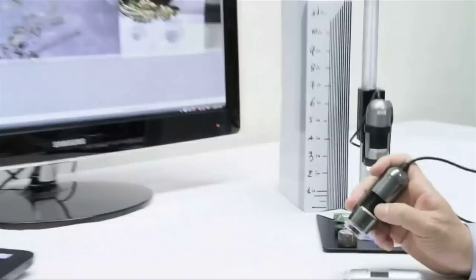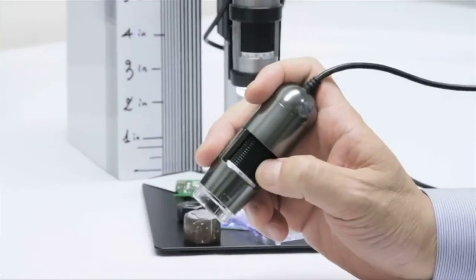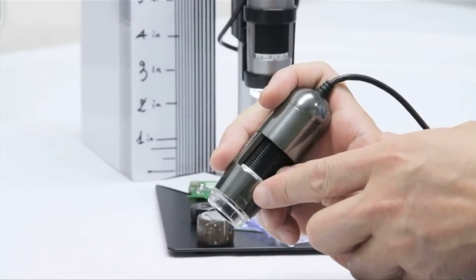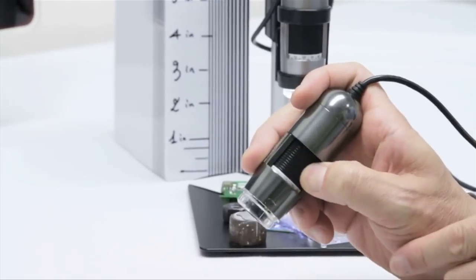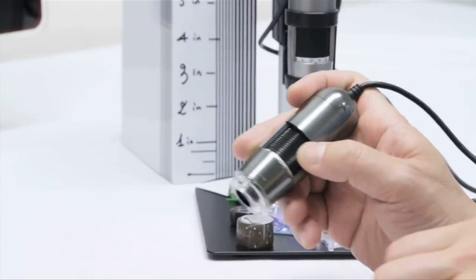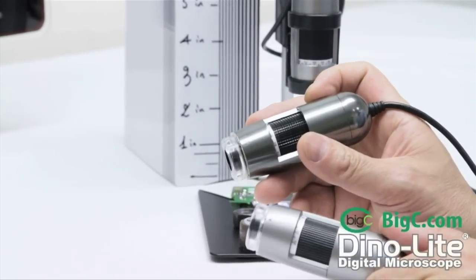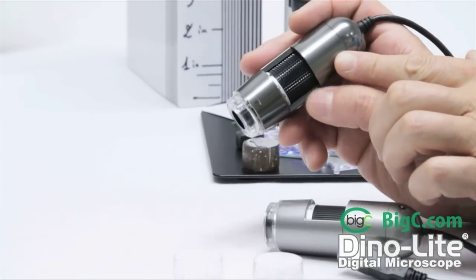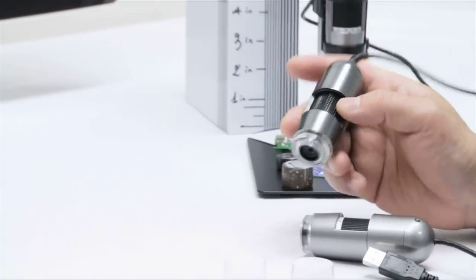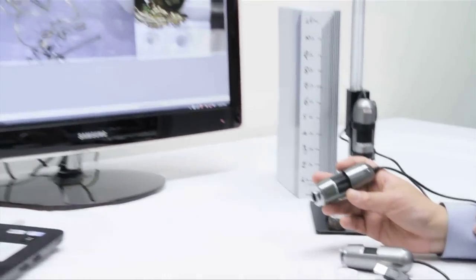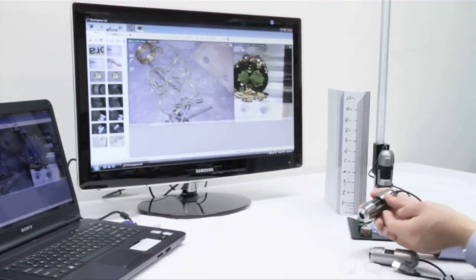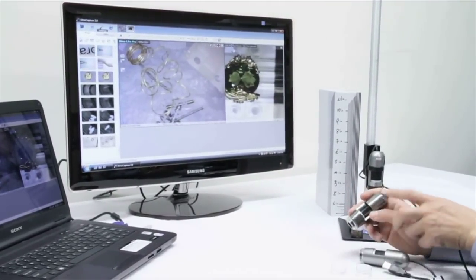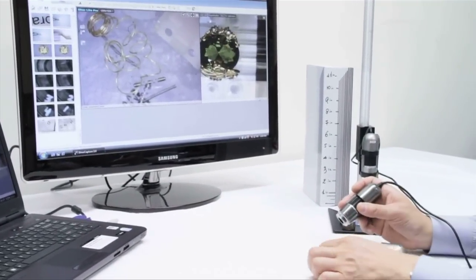This model comes in plastic as well as the metal option of housing, and that's an aluminum metal housing. The metal model features a metal housing, a metal focus dial, and a reinforced cord that comes out of your microscope as well.